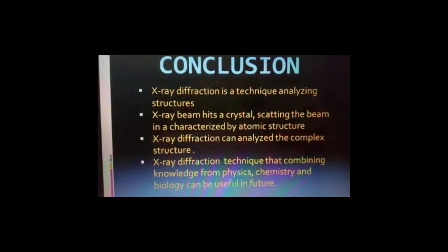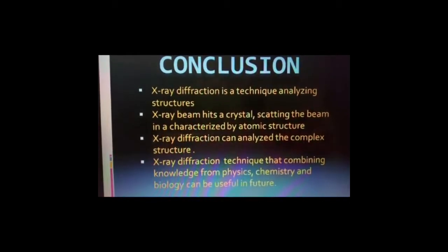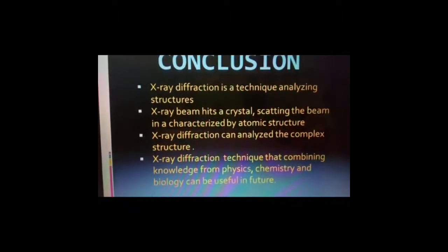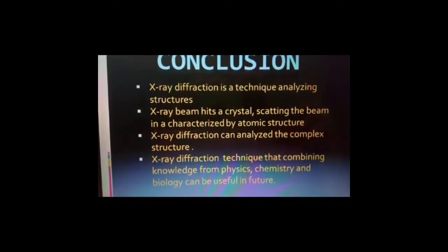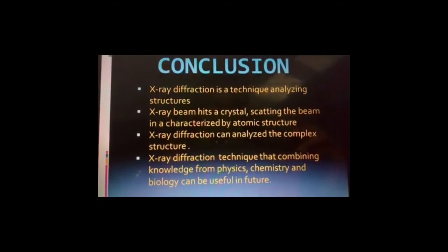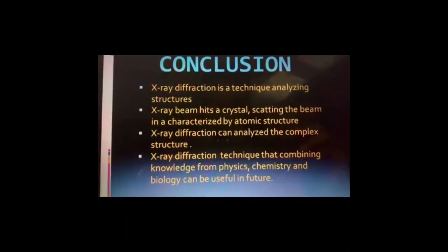X-rays are also the tool of choice, and their scattering off the crystal at certain angles gives us the ability to apply Bragg's law and solve the distance. Because of the small distance, we are required to measure the atomic separation indirectly by use of electromagnetic radiation. This is due to the fact that visible light has wavelengths in hundreds of nanometers, effectively barring us from visually resolving it. X-ray diffraction is also not expensive and is the most convenient, worldwide-used method to determine crystal substances.